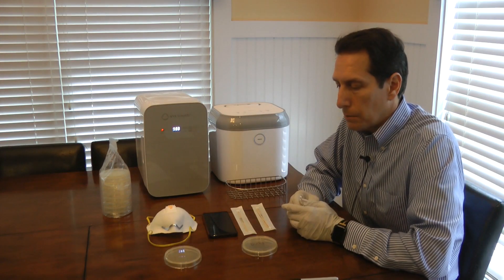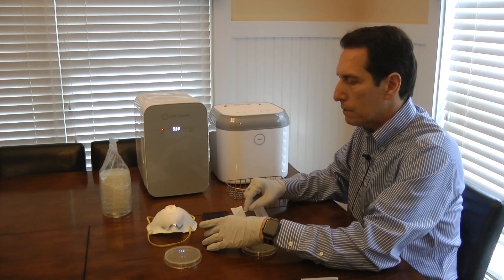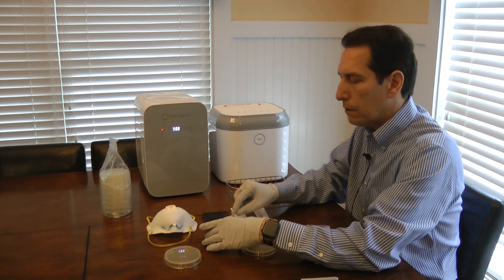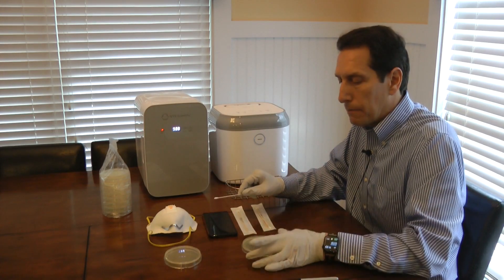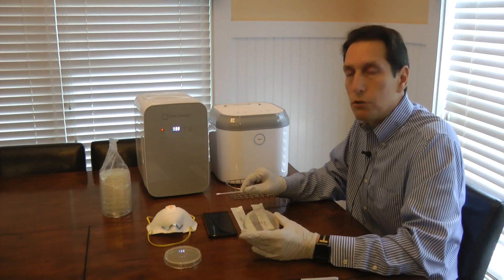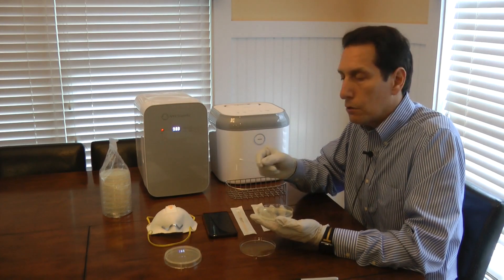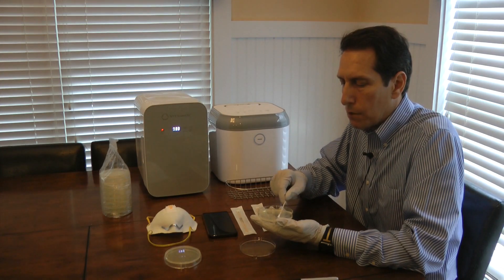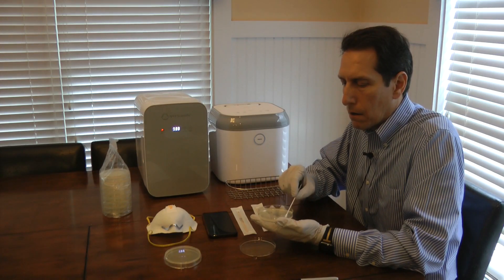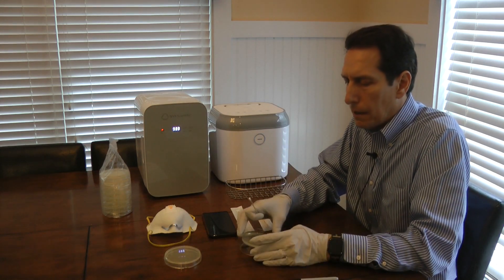So for the first part of the experiment, I'm going to take a cotton swab and gently roll it across the surface of my cell phone. We'd expect our cell phone to have quite a bit of bacteria on it because we're constantly handling it as well as holding it up to our face. I've marked one of the petri dishes 'dirty,' meaning I haven't cleaned the objects yet. I'm going to take the dirty swab and gently scrub it across half of the petri dish, rotating the swab as I go, to get those bacteria onto the agar plate.